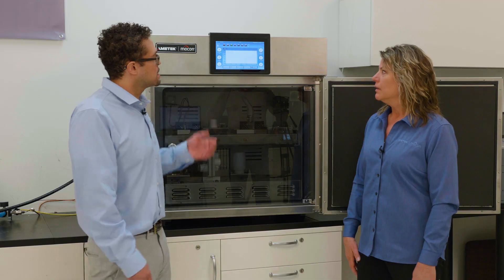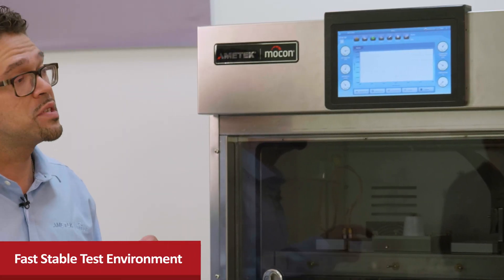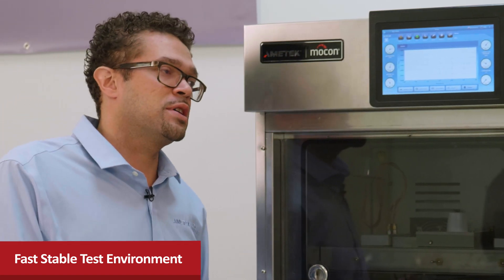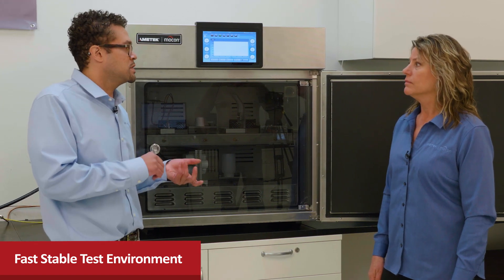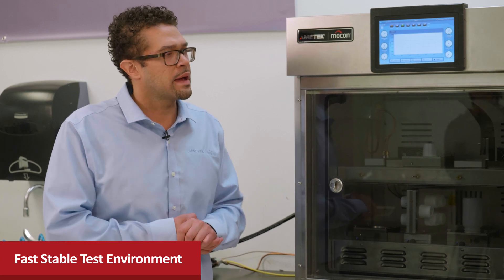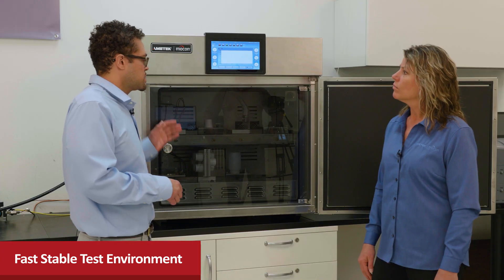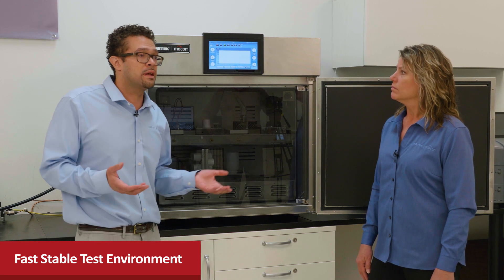With this instrument, this is all done automatically. So it holds a very stable temperature and a very stable RH. What that allows is every time you run a test, you're getting the same challenge conditions — you're not fumbling with dials and turning things down and turning things on. So it really adds efficiency to that aspect of testing. Another great feature is that you can set this from a low temp to a high temp and it comes to thermal equilibrium within an hour.